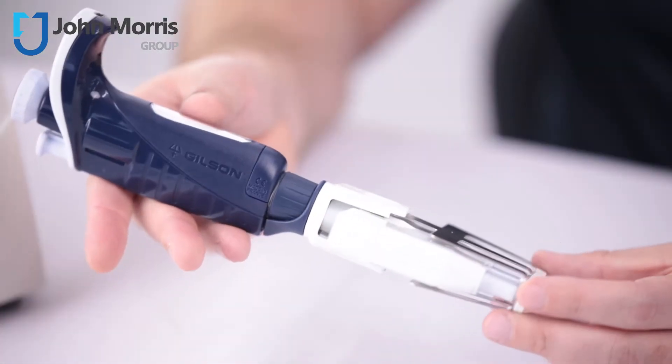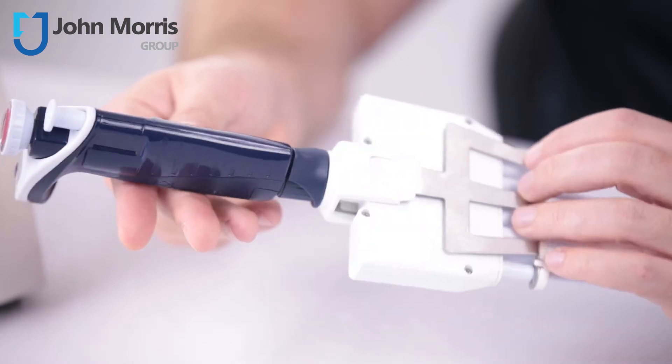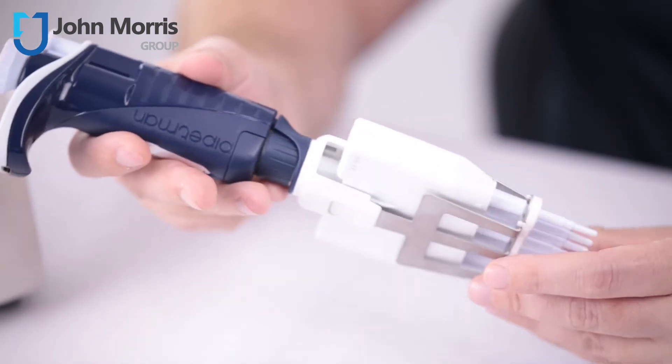Today, we'll be talking about electronic multi-channel pipettes. These products are designed to bridge the gap between manual pipetting and automation. They're perfect for applications like PCR, ELISAs, or whenever you're doing 96 or 384-well work.